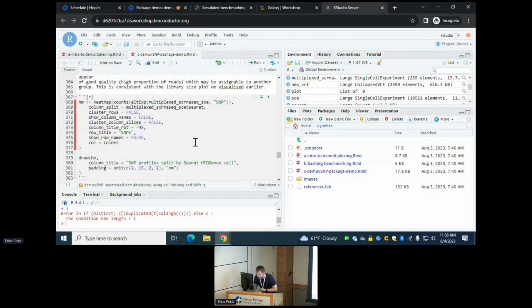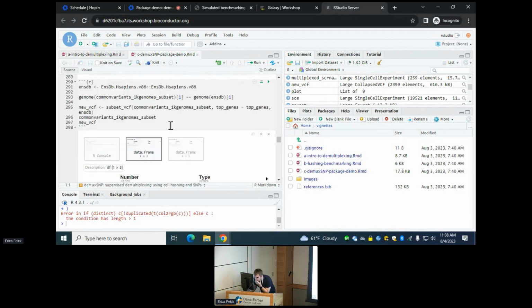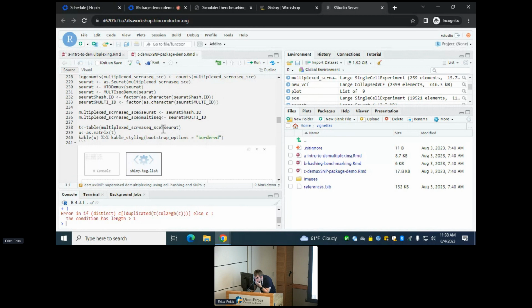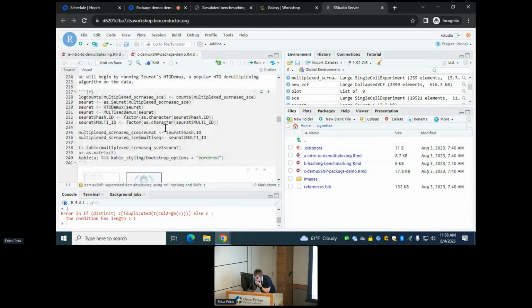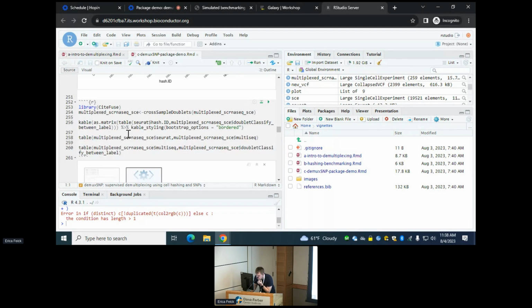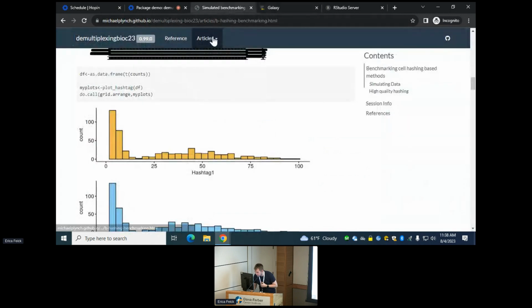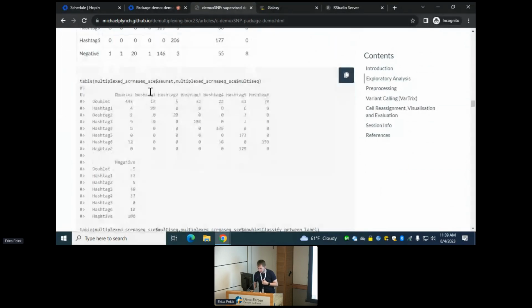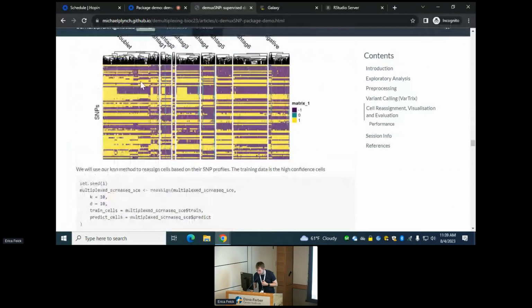So I was wondering if this is the same, right? I was talking to one of the cores here locally, and they were saying for BioLegend HTO types they're losing 20%. Yeah, between 10 and 20. And that's what we were seeing in this data. We were losing 10 or 20% with low recovery rate on some of the really important tumor samples, which is why we started on this whole thing of trying to see if we could use SNPs to recover those cells, because 10 or 20% when they're important cells, and those are patient tumor samples we'll never get back again, it's a lot. If it's cell lines, you don't care so much, but if it's patient samples, we care.